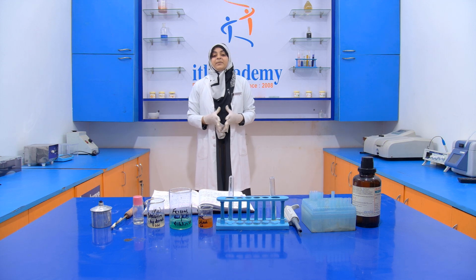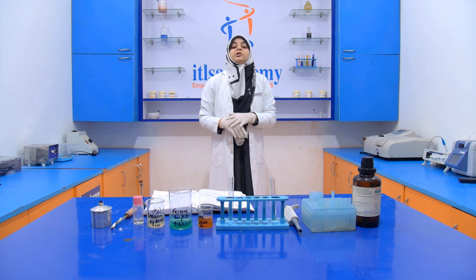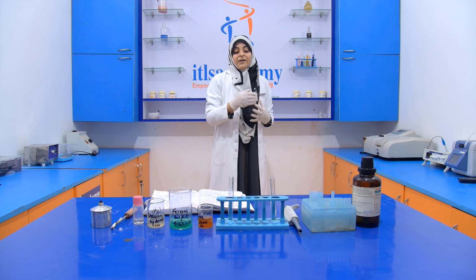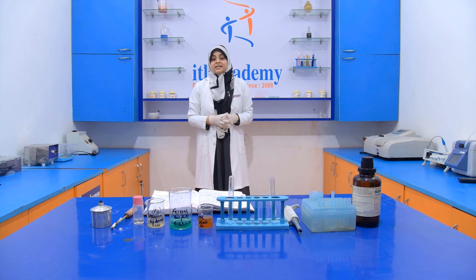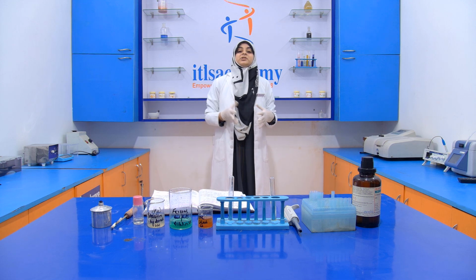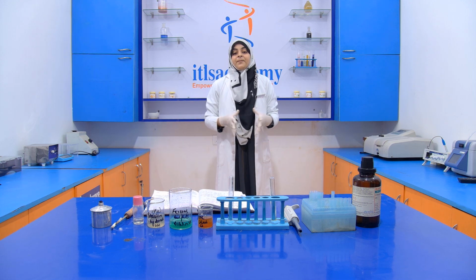Otherwise it will damage and burn our skin, cause irritation, and also affect our eyes. We also have to avoid inhaling the vapors of concentrated HCl, so that it will not damage our respiratory tract and digestive tract.